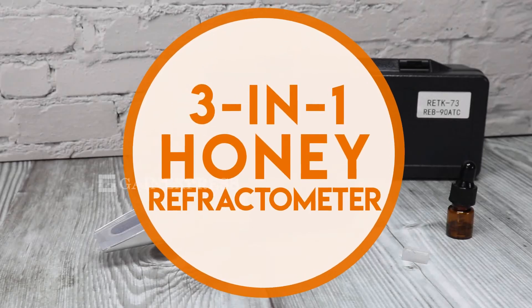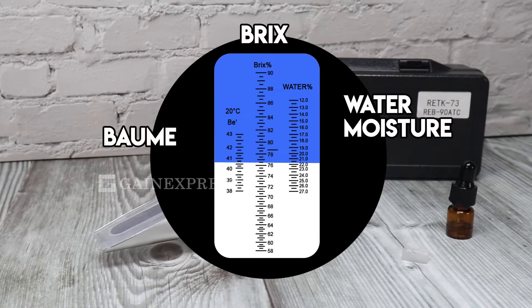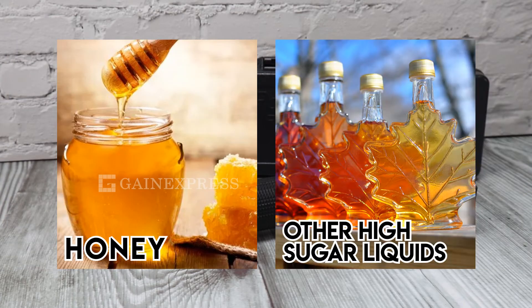3-in-1 honey refractometer. This refractometer can measure the percentage of water moisture, Brix, and Baume level of honey and other high-sugar-related liquids.